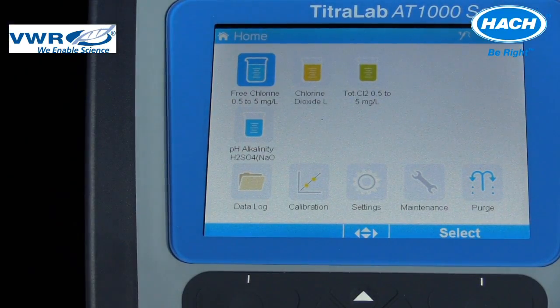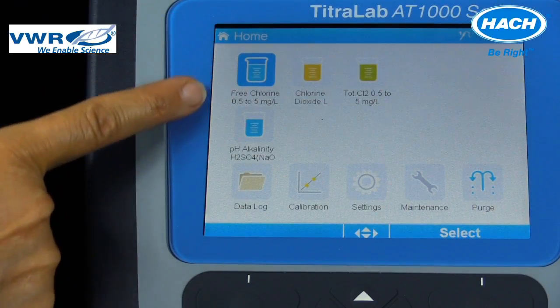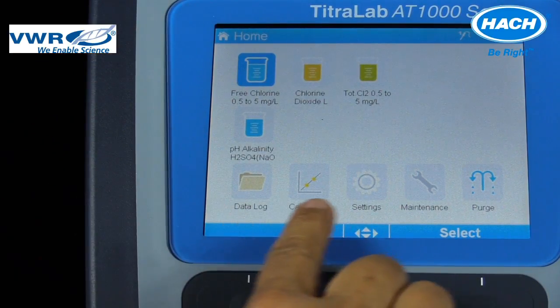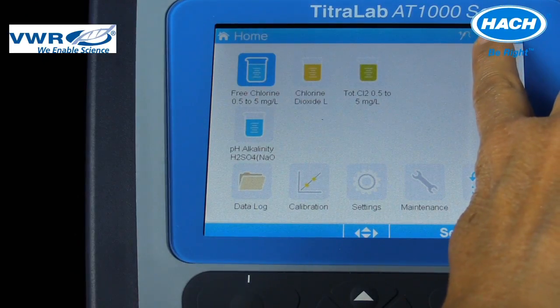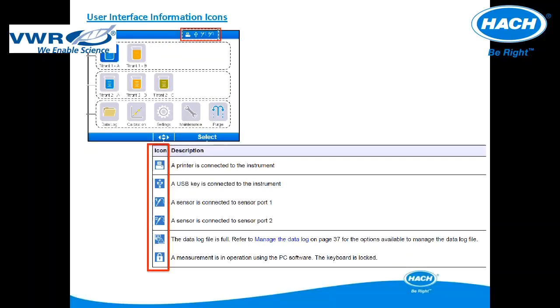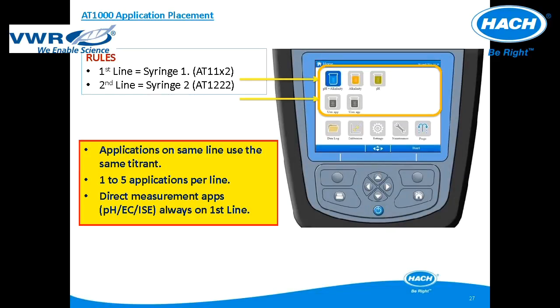The home screen contains the loaded applications, available software menu options, and icons signifying connections to the titrator. Connection icons shown in red include a printer icon, USB key icon, sensor connections to port 1 or port 2, full data log, or keyboard is locked. Applications are loaded in the first or second row of the display. The first row is applications that will utilize syringe 1, and the second row will use syringe 2 if the titrator has more than one syringe option.